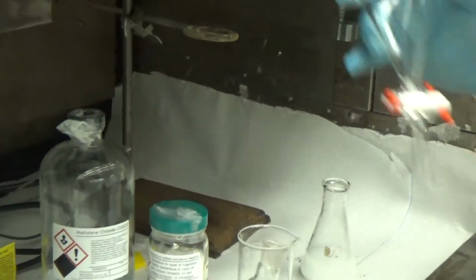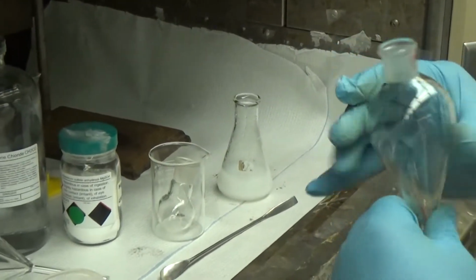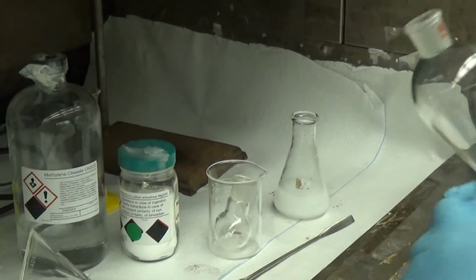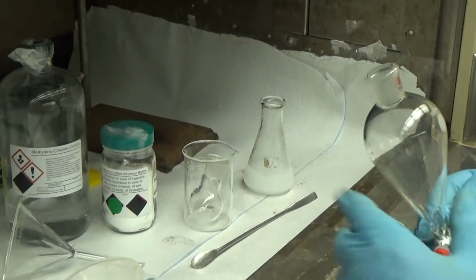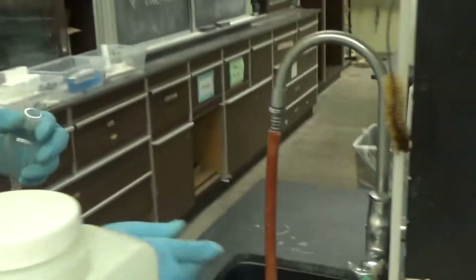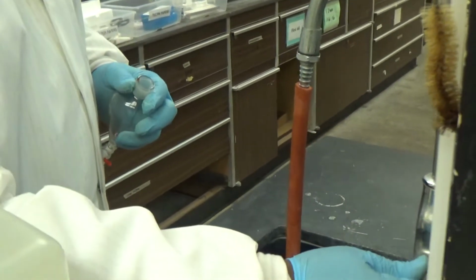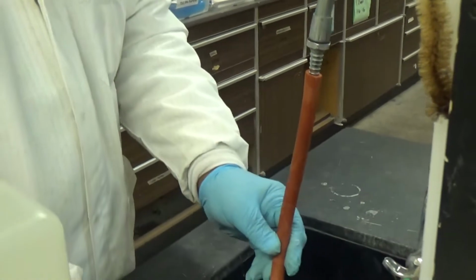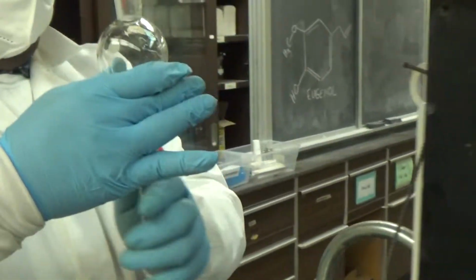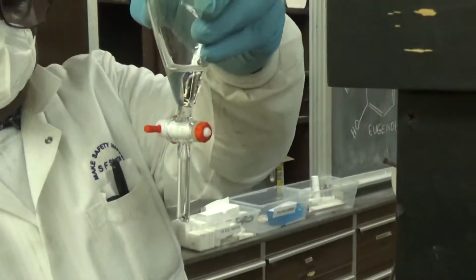The first thing, you have this separatory funnel, but you need to check that it is not leaking. The way you do that is very easy. You open the water, put a little bit of water in there, and you see that it's not leaking.